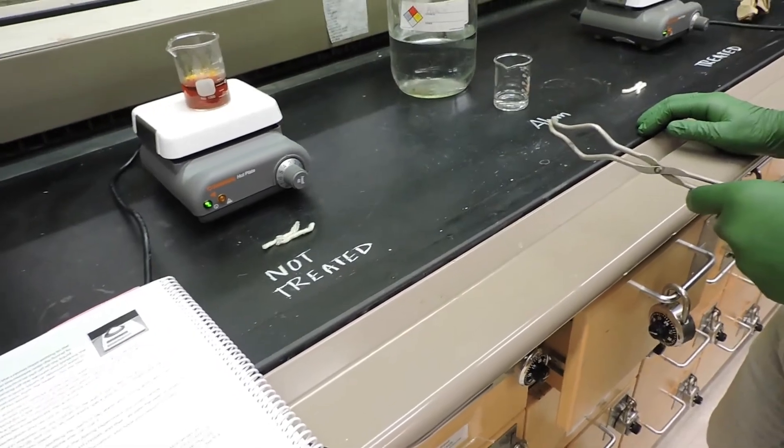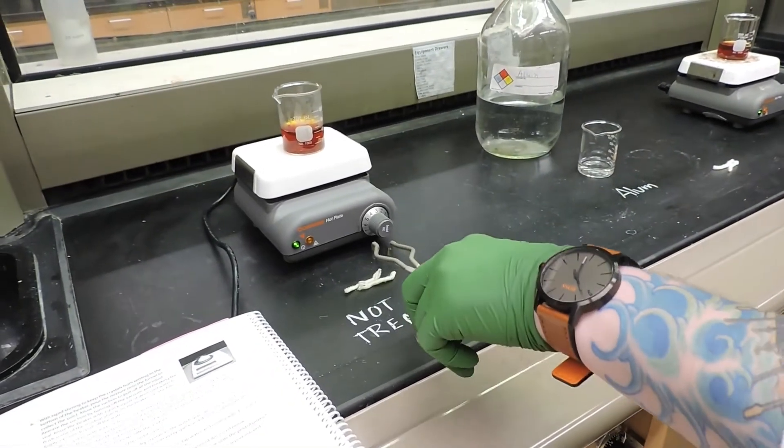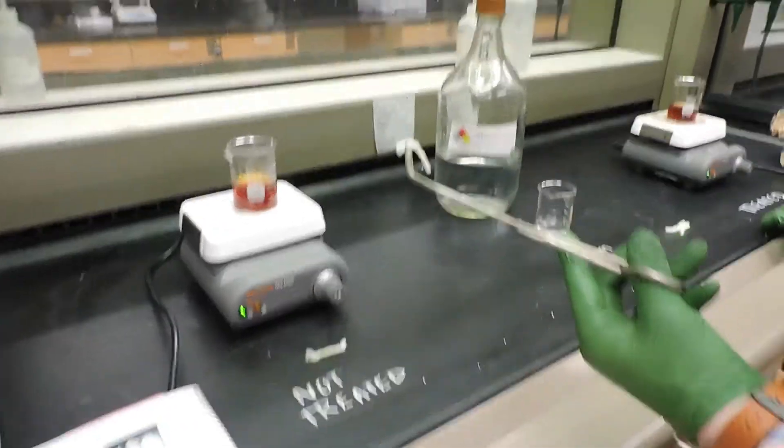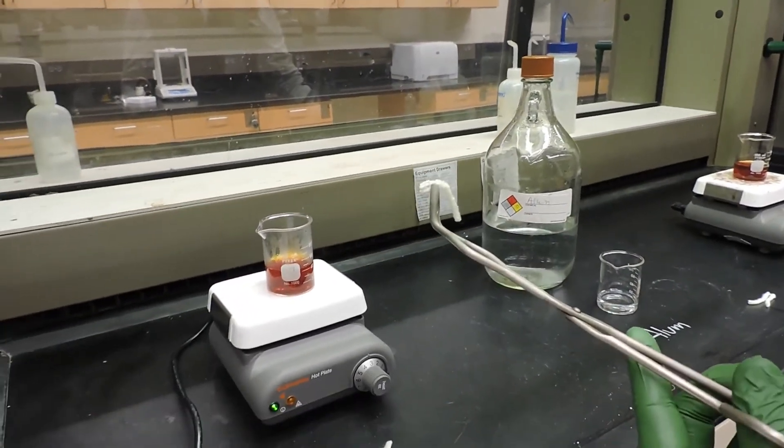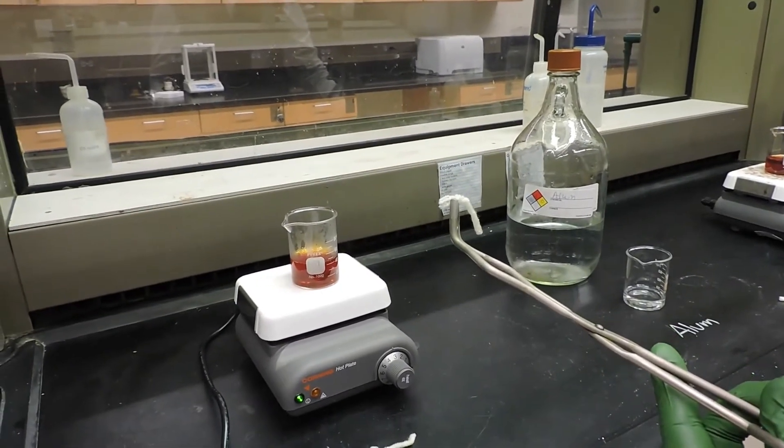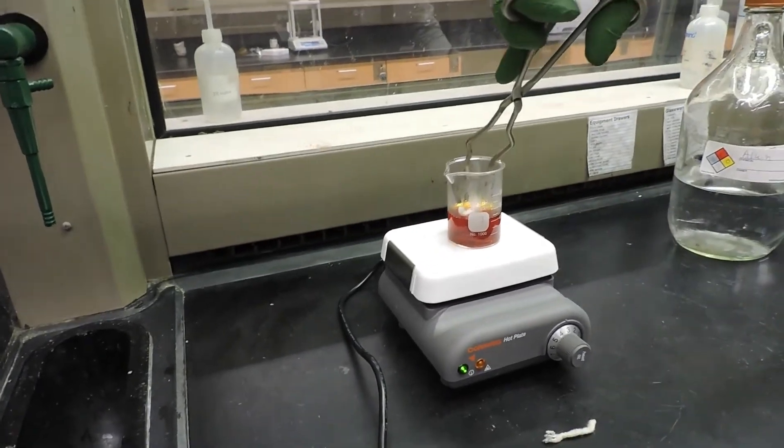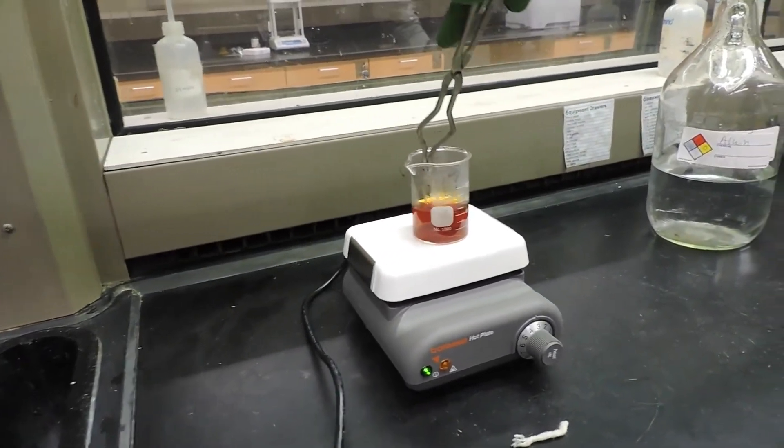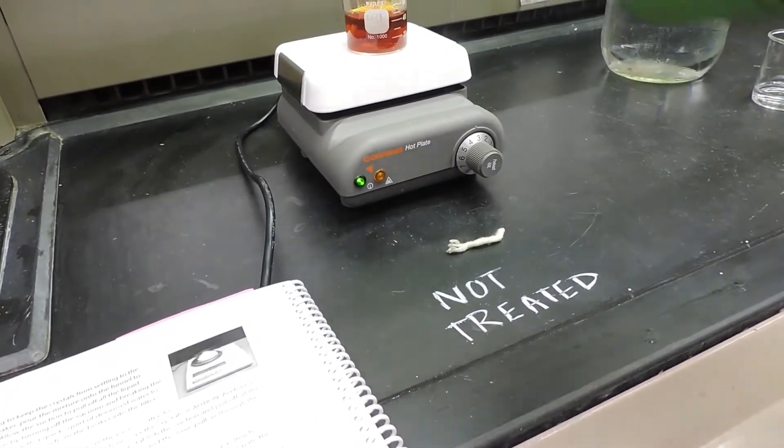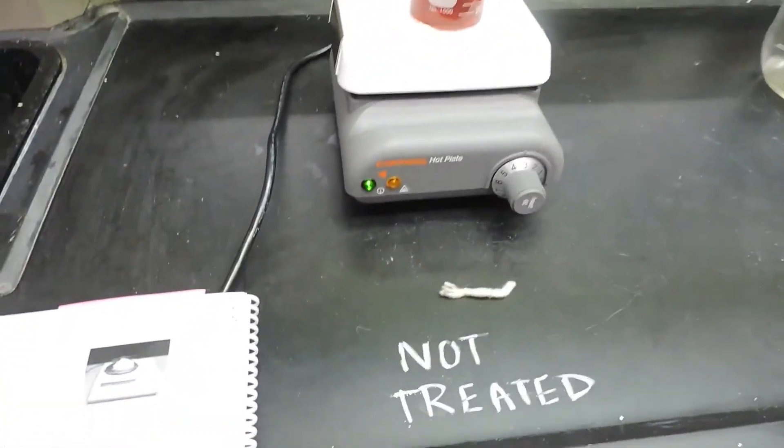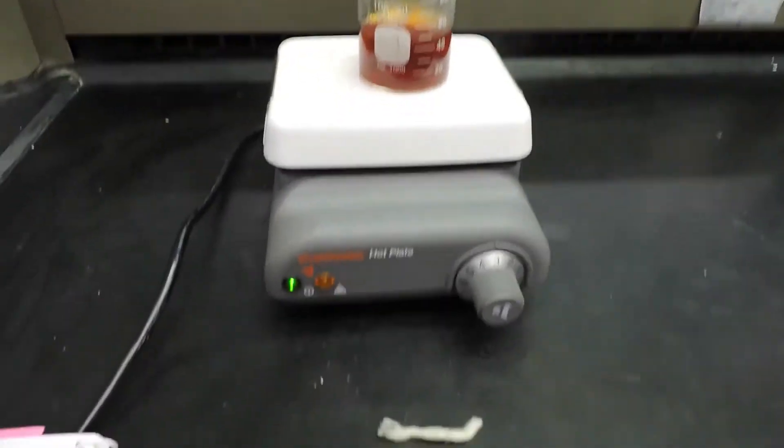So while we're waiting for our alum to crystallize, we're going to go ahead and do part C. So we've obtained two pieces of wool. And first we're going to soak one piece of wool in an alizarin bath for two minutes. And this is our non-treated bath. So this is just going to be the alizarin dye in our warm bath.